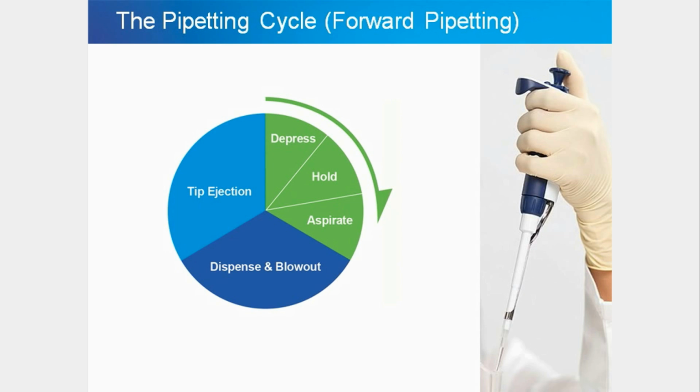Place the correct tip onto the shaft or liquid end of the pipette. Remember, with universal fit systems, you will want to ensure that the tip is secure to prevent leakage. With Rainin's LTS system, this extra caution is unnecessary because all tips seat and secure the same way. Step 1 is to depress the plunger from its resting or home position by pushing down on the button at the top of the pipette until it reaches its first mechanical stop.